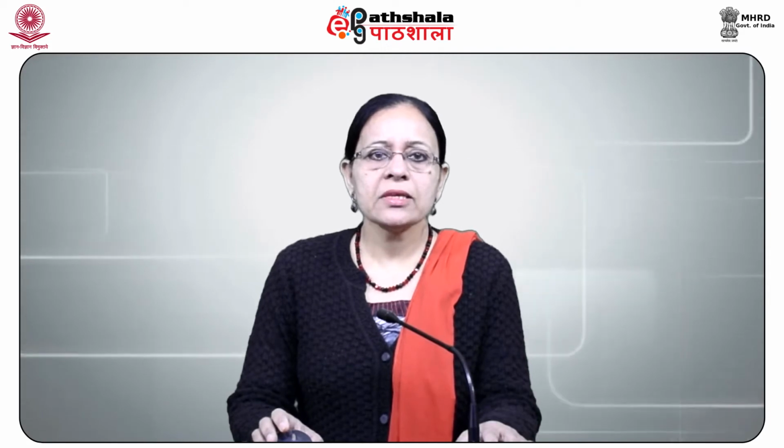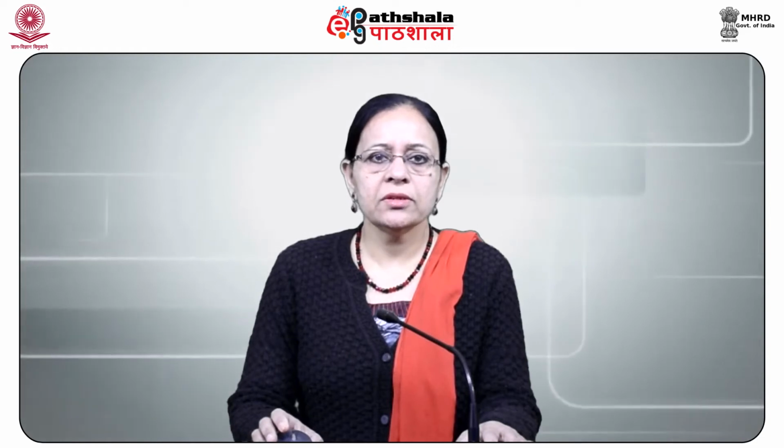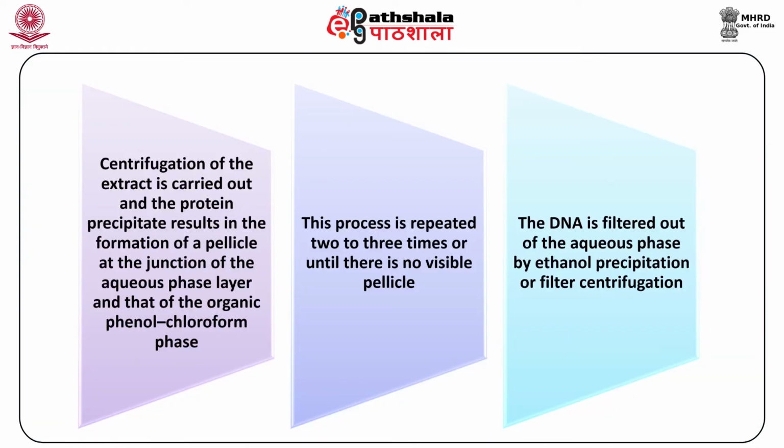Phenol chloroform is added to the cell lysate and mixed, and the phenol denatures the protein. Centrifugation of the extract is carried out and the protein precipitate results in the formation of a pellicle at the junction of the aqueous phase layer and the organic phenol chloroform phase. The process is repeated 2 or 3 times or until there is no visible pellicle. The DNA is filtered out of the aqueous phase by ethanol precipitation or filter centrifugation.